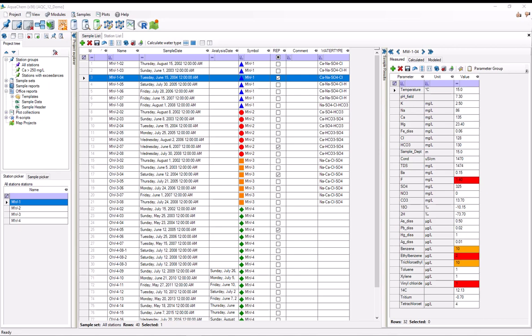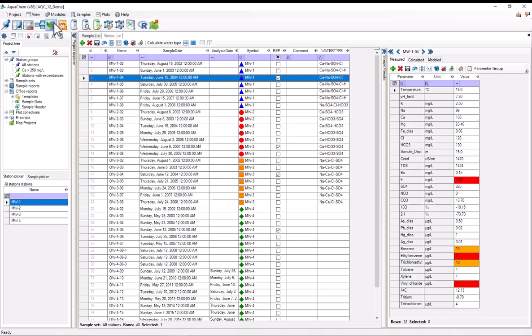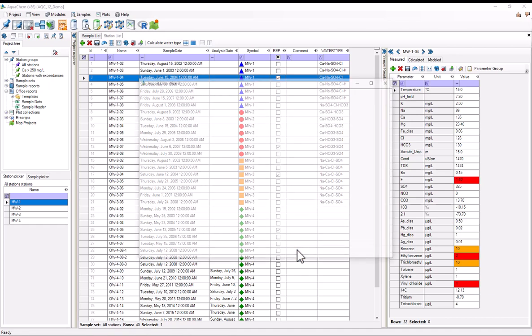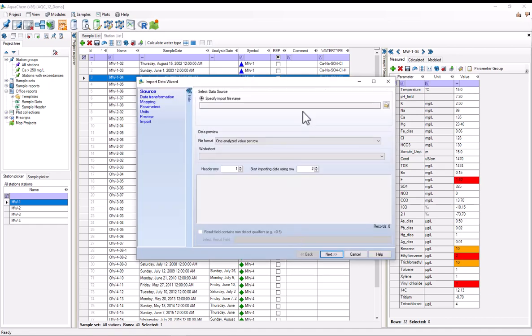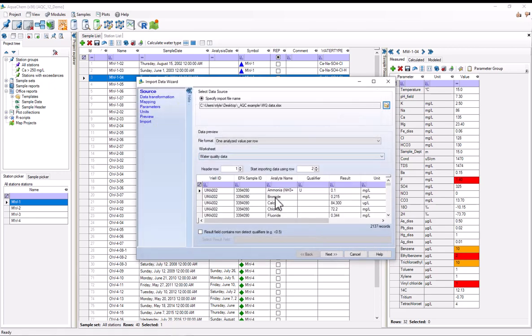And now that we're back in the software and I've gotten all that out of the way, we can start import. So to import data, you go to modules, import data, or you can just select the icon right off of the module toolbar. Select it. I'm importing samples, so I'll keep it on samples and I'll hit OK. And now I need to specify the import file name. So I'll find the spreadsheet. Hit open.